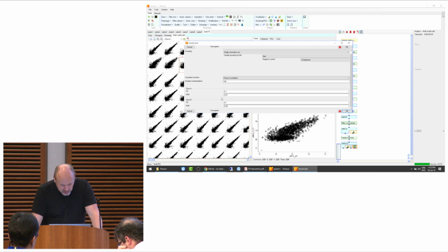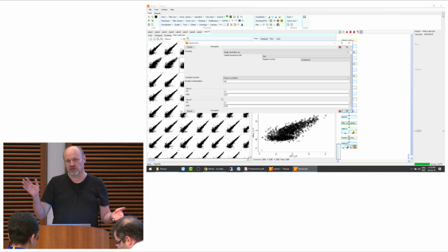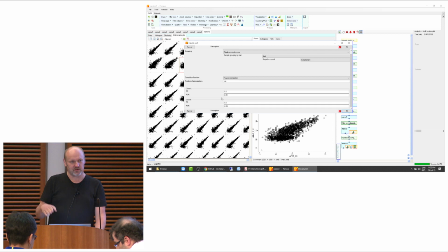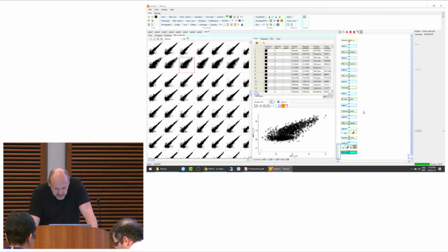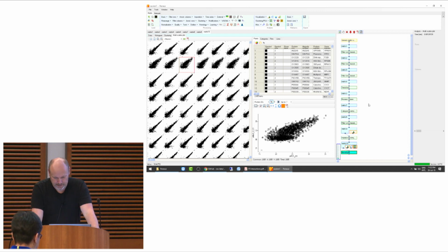So then one can wonder, okay, what should I put for the S0 value? So we have here default value 0.1, and since we're always using more or less the same technology, right? So data coming from Orbitrap with the same dynamic range always, and LFQ as an algorithm, there's no reason why this should actually change all the time, right? So my recommendation would be just to leave it at the default values, and that's it. So let's do that. And now it's calculating, so it takes a bit because it has to do all these randomizations from your permutation-based FDR calculations. But hopefully it shouldn't take too long.